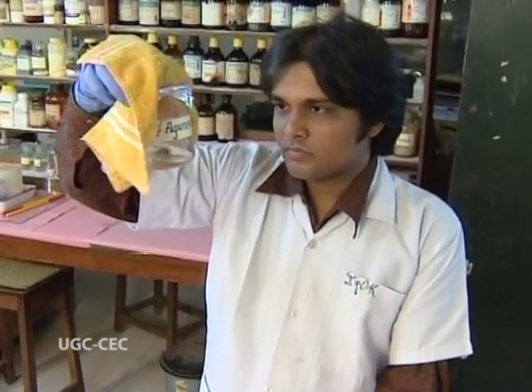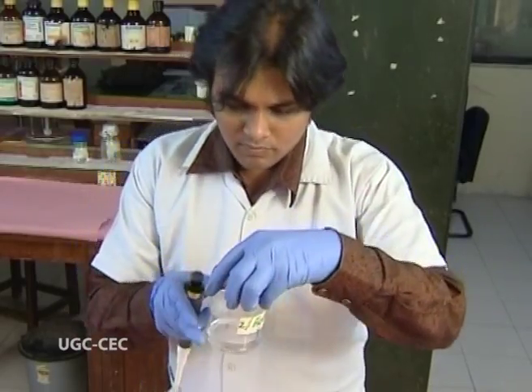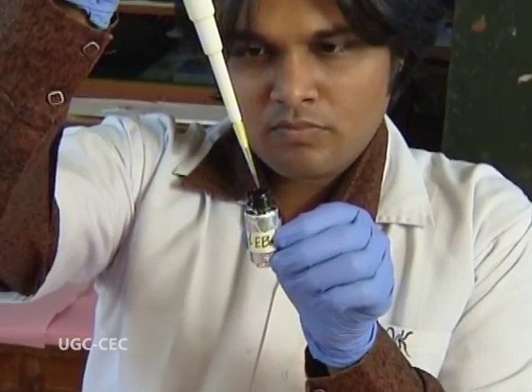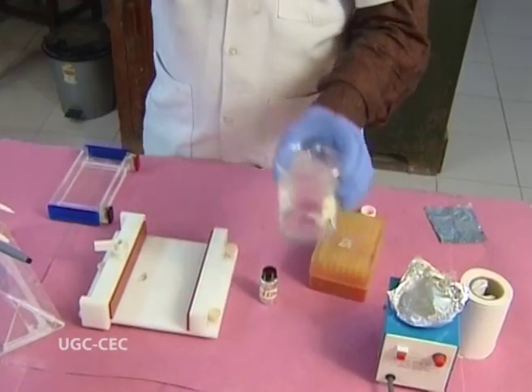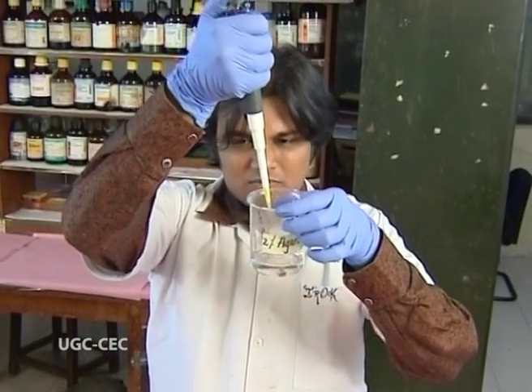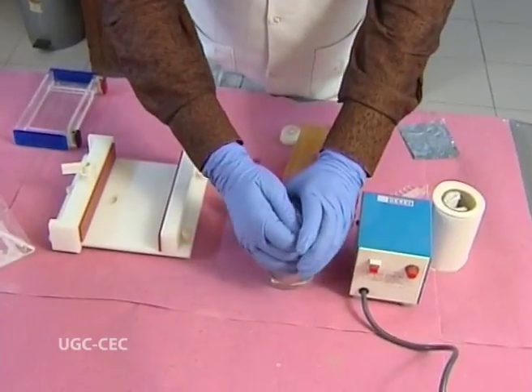Once the gel is tapped, we keep it on a table and let it stand for some time. Then we add EtBr, that is ethidium bromide. It's a tracing dye. One has to be very careful while handling it because it's very carcinogenic. It can cause skin cancer. We generally prefer wearing gloves while handling.